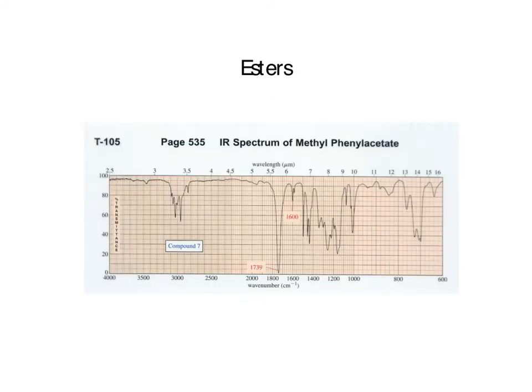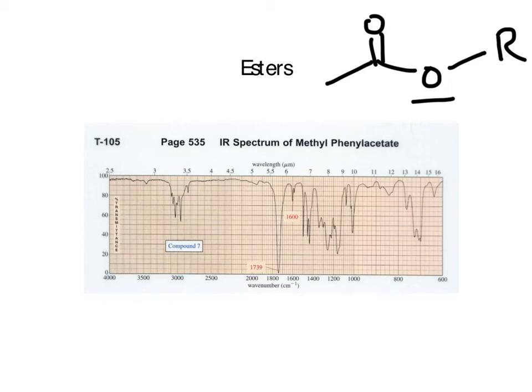We're going to look at esters. Those are carbon-oxygen double bonds that are directly connected to an oxygen. What we start to see is the electron withdrawing effects of the oxygen taking over, and we start to get a very strong bond polarity here. And so these peaks tend to be very, very strong. We have this peak coming around 1740, a little bit higher than the other ones, but still very close to where a ketone or an aldehyde appears.